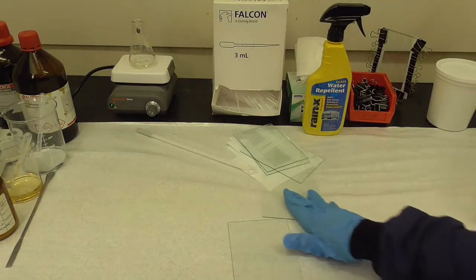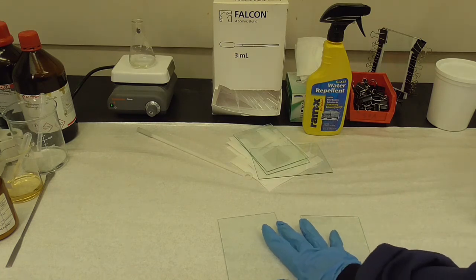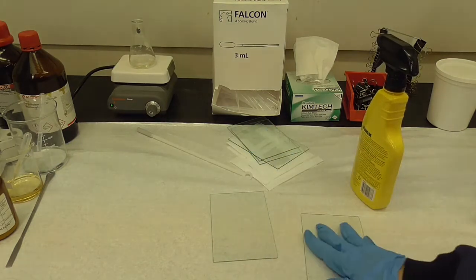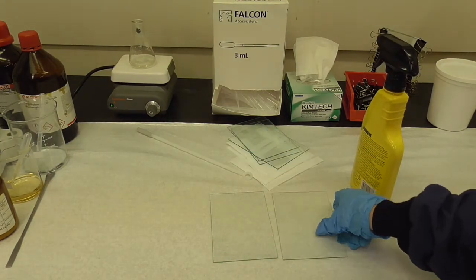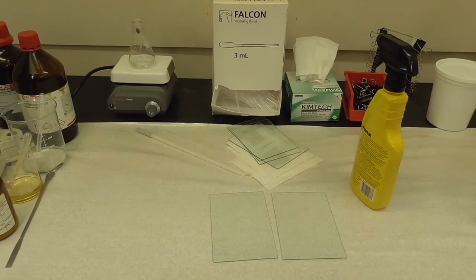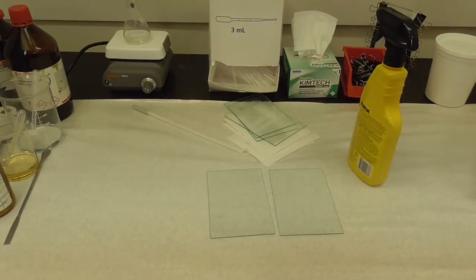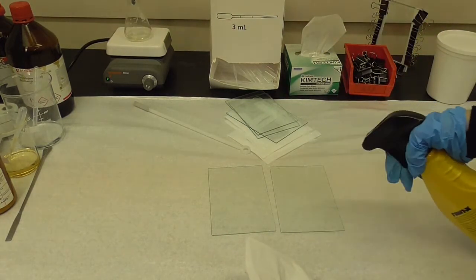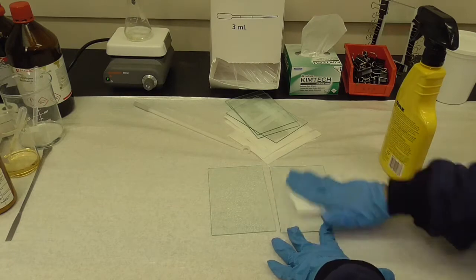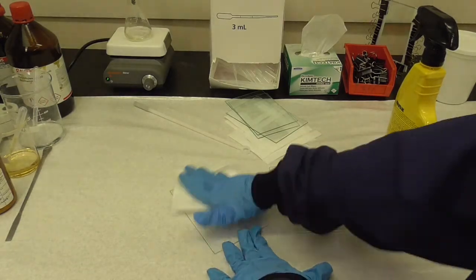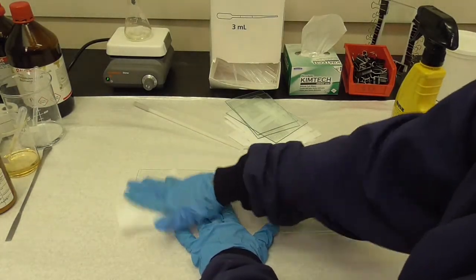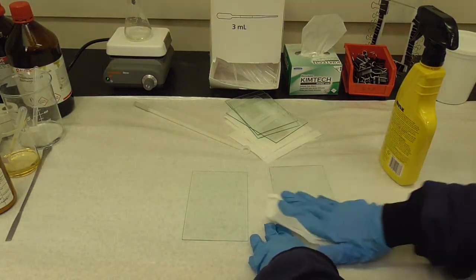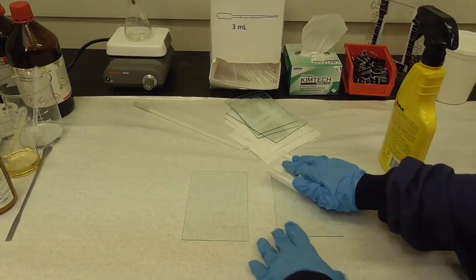Before you make the mold you want to coat your glass with the mold release and we just use Rainex. So you just spray the Rainex on the glass and dry it off. Then coat both sides so you don't have to remember which side you did.